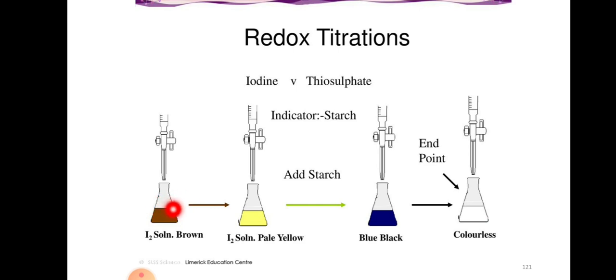So we are going to treat this iodine solution with thiosulfate till color becomes light yellow. After that we are going to add starch. When we are adding starch the solution becomes bluish blackish color. This is not the end point. We are going to add thiosulfate till the solution becomes white color or colorless. We are not directly adding the starch to get an accurate end point.